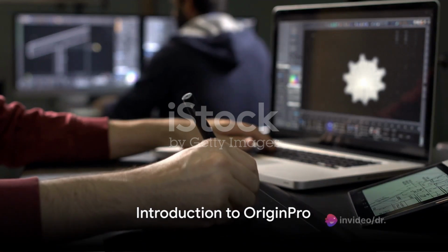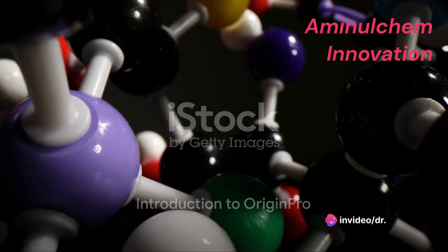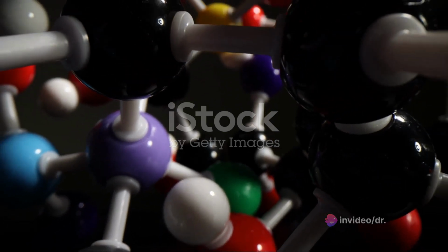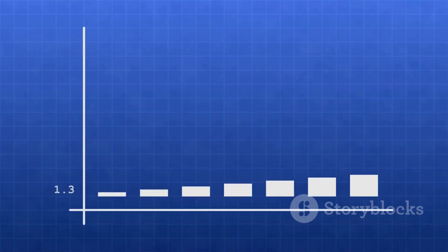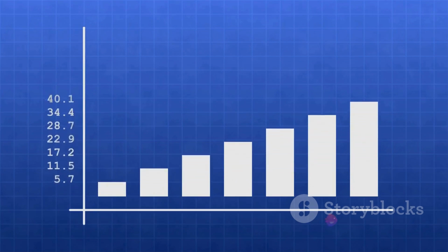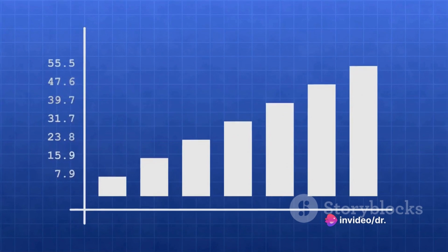Have you ever struggled with drawing graphs in Origin Pro? Does the idea of fitting linear and nonlinear adsorption, kinetic, and isotherm models seem daunting? Well, no need to worry, because today we're diving into the world of Origin Pro to demystify the process and ensure your graphs are of publication quality.